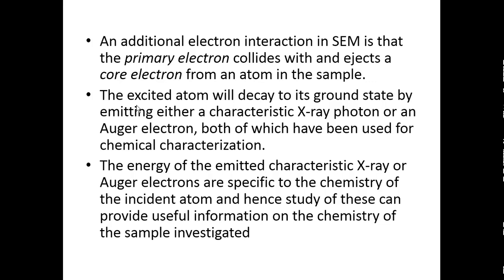These two types of emissions, X-ray photon or Auger electron emissions, both have been used for chemical characterization of the material surface.